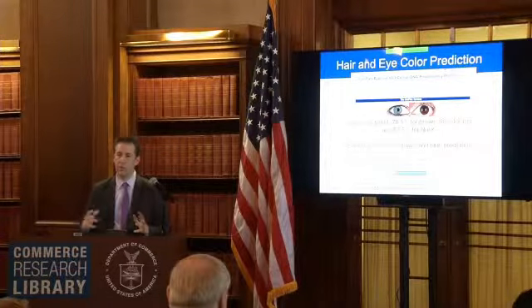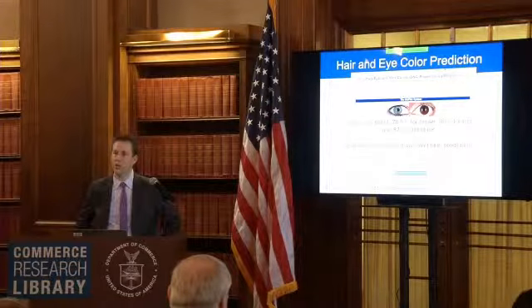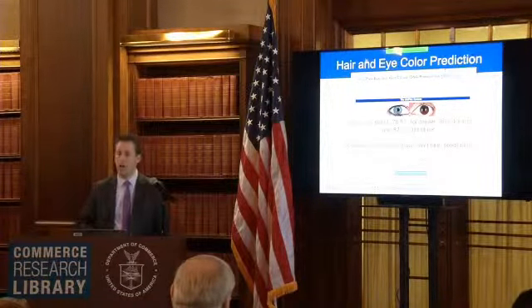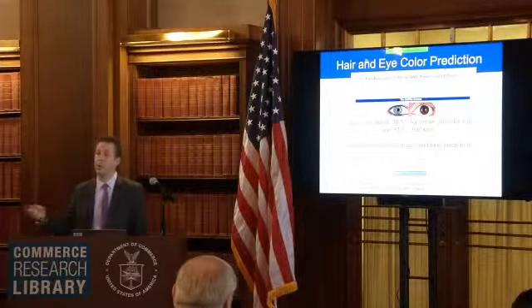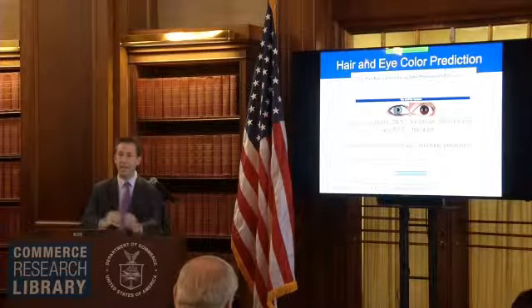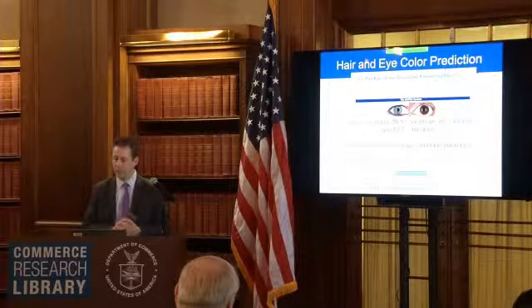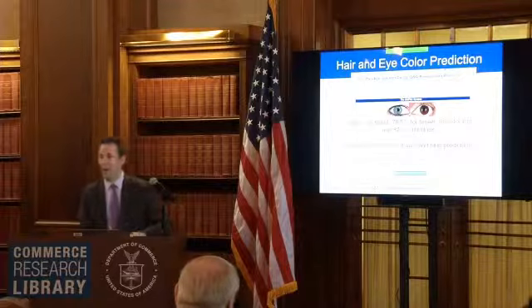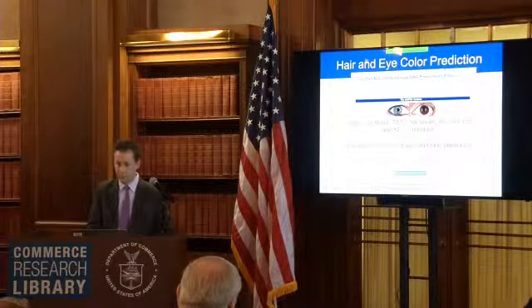But I wanted to throw this up because this is interesting to people, to take a cold case sample and see what kind of information you can get from that. But also stating that the levels of information you're getting aren't the 1 in a billion, 1 in 3 trillion like we talked about earlier. Because I think sometimes when people hear about DNA in forensics, they assume that high level of certainty. So for these types of predictions, this is where we're at right now, in this 80% range or so. We're not at that certainty of a match.